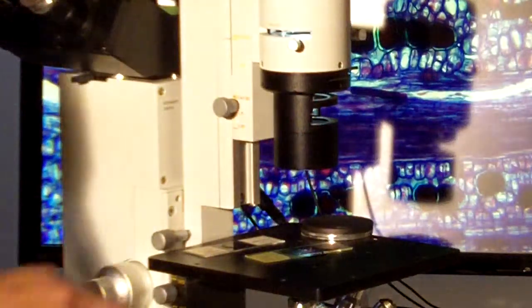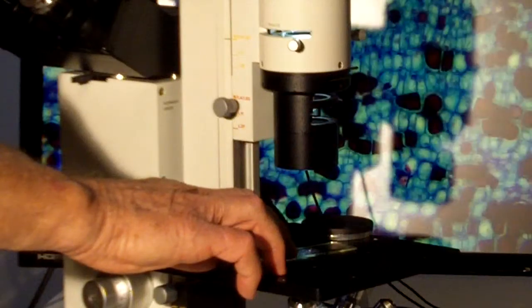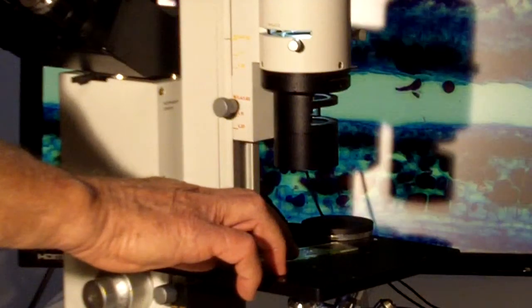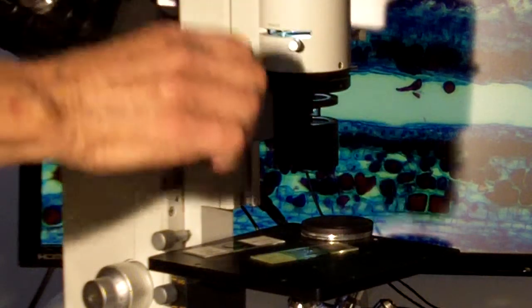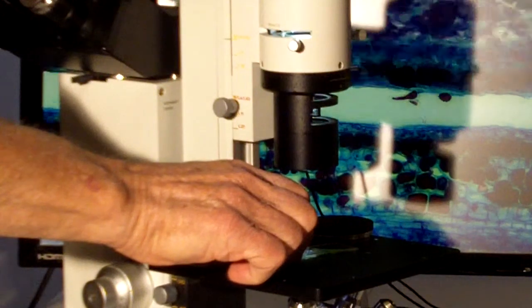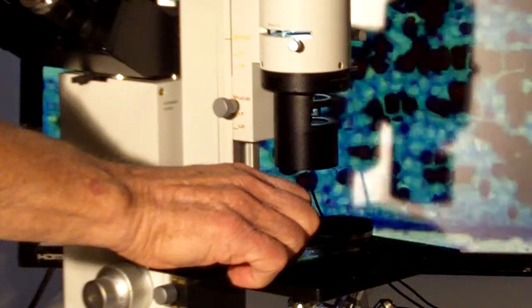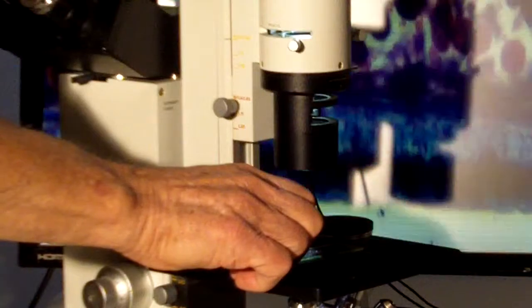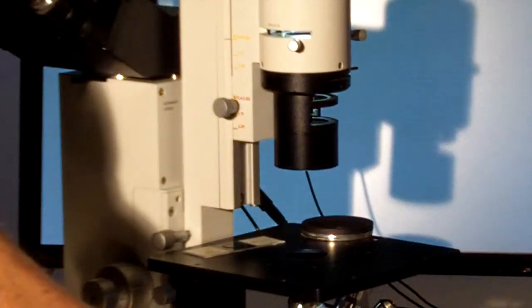Here you see a teaching slide in real time and this is good for studying slides that were prepared and stained, dead of course, to get the whole concept going for cell structure and allow kids to look at things like mitosis going on in cell activities.